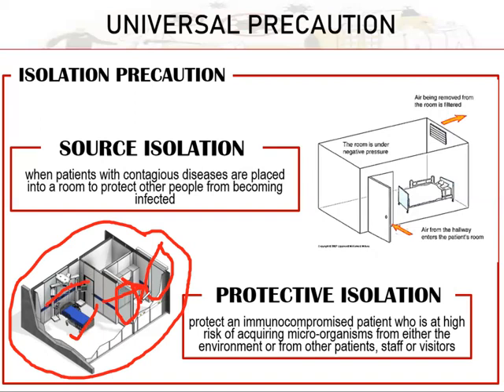Okay? So, ma'am, I thought bedside manner. I thought sa tapad gid ni pasyente mag-perform og or mag-label og sample. But in this case, class, naa tay exemptions, no? So, we are sure man na ang tag-iya sa dugo is the patient. It's because siya naman ang isa sa sulod sa isolation room. So, we can do the transferring of blood here and the labeling just to minimize the infection.